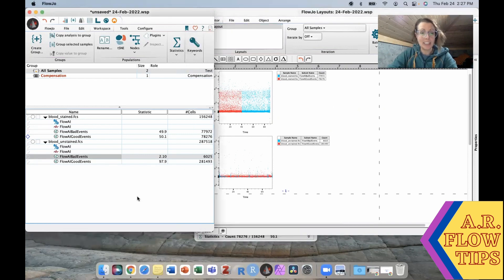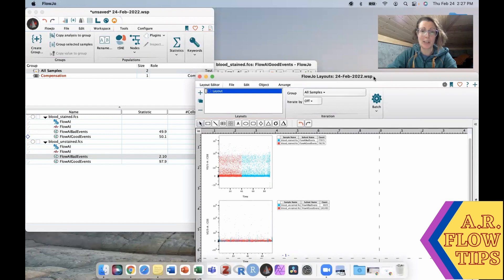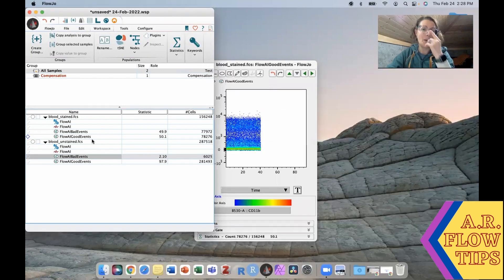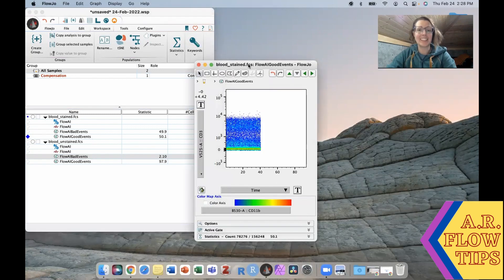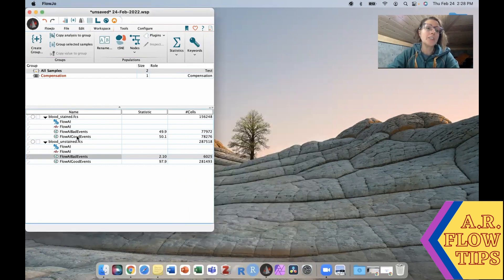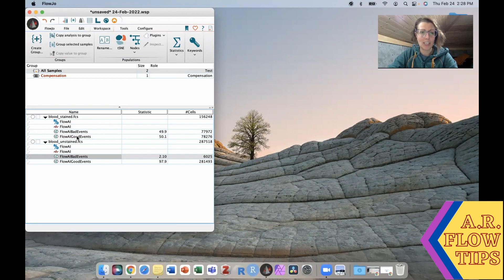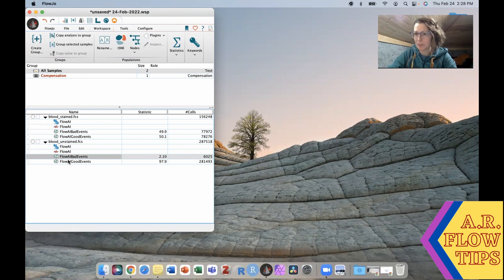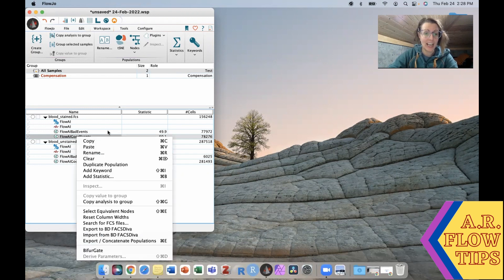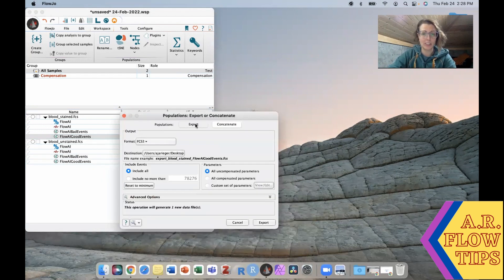Now in my FlowJo crash I lost my original gate. Lesson learned, always save. But it allows me to show you actually another part of my workflow. What I normally do at this point, because transferring gates between gates that aren't matched can be a little bit of a pain especially in a big experiment, is go in here and actually export this population.